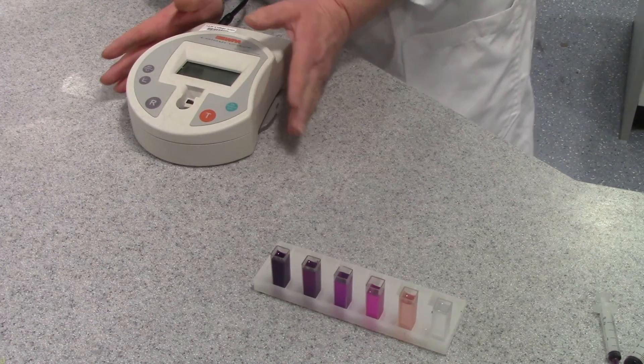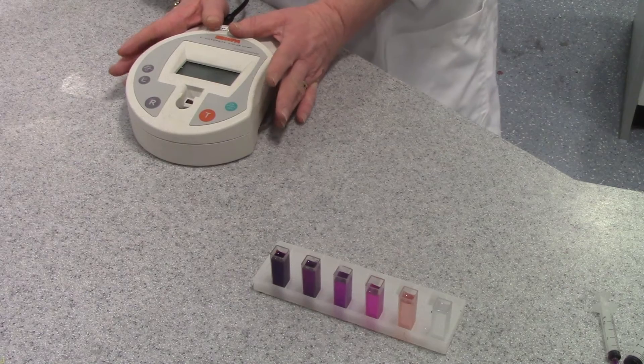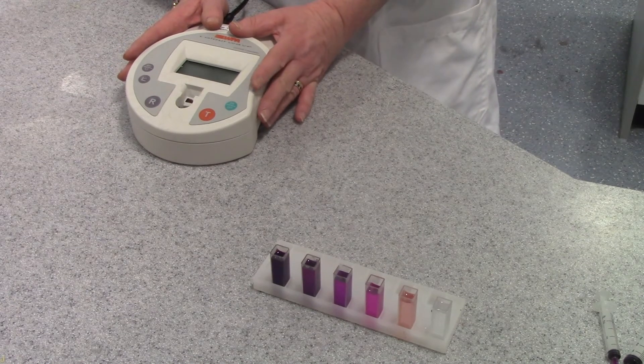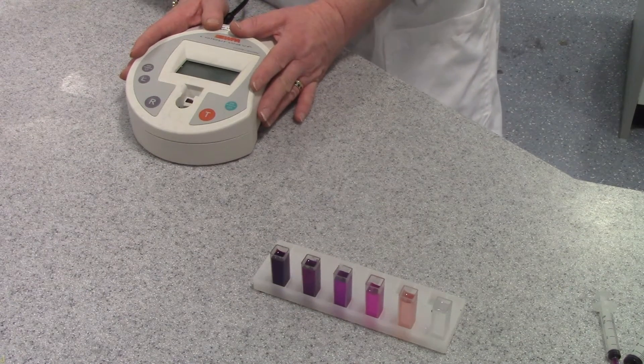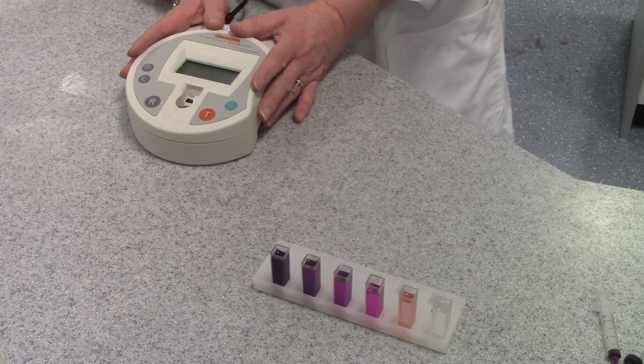This is a colorimeter. It's a piece of equipment that is used in quantitative analysis in order to determine the concentration of a solution. It does this by measuring the amount of light that's absorbed by the solution.